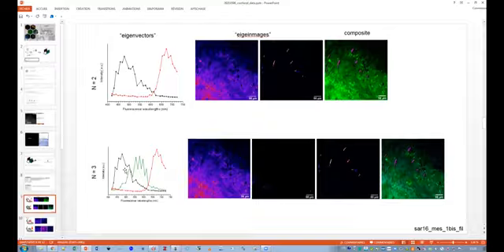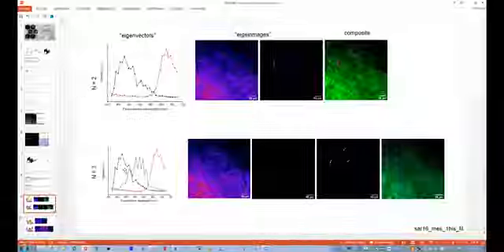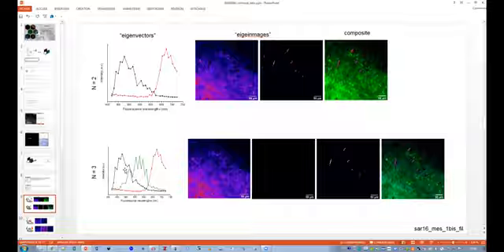I'm not qualified enough to answer that, but I don't even understand everything. One eigenvector represents a lot of pixels. Yeah. It's a class of pixels. Yeah. And for each of these pixels, you have an individual spectrum. Yeah. So I wonder whether there is a lot of diversity in all of these spectra that are represented by a given eigenvector.